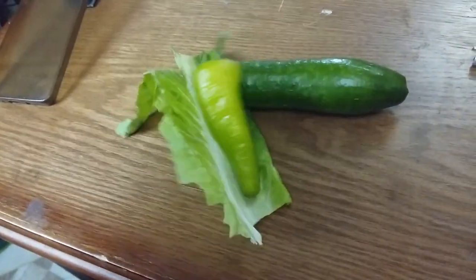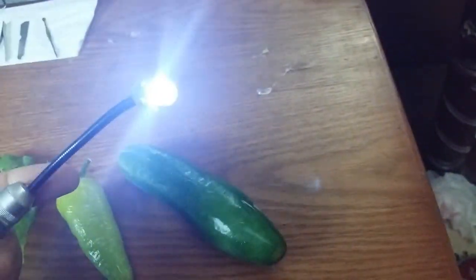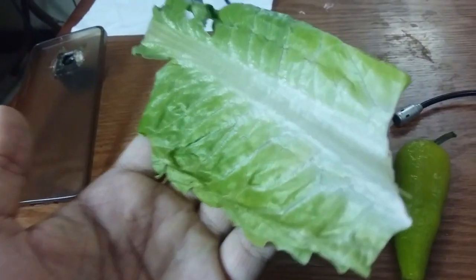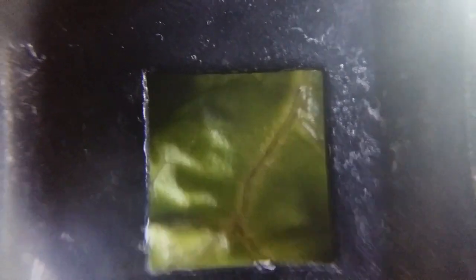Let's try it now with some vegetables. This is a light if you don't know what it is — or cut it into two pieces. Let's see it. This is a cucumber from outside — nothing special. And this is how it looks from inside. Still nothing special.